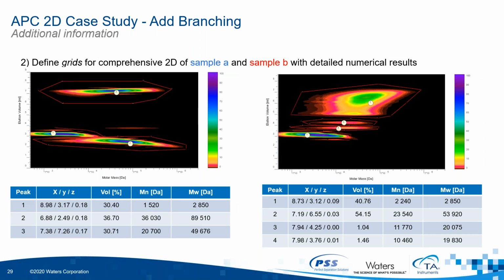The results are shown here on this slide. Please note that the x-axis here is no longer the elution volume from the second dimension, but it is molecular weight in log scale, as you are used to from your GPC results. Slight shifts of the peak compared to each other are observed as polystyrene peak 1 and PMMA peak 2 are evaluated with matching calibration curves.